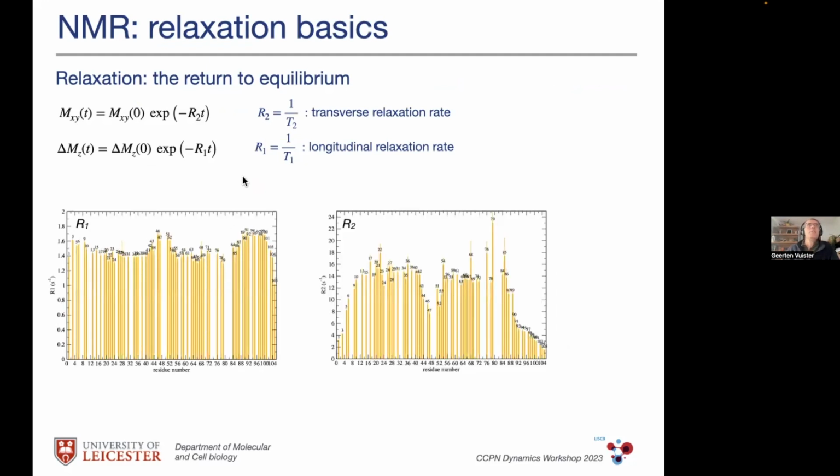Okay, as a result of doing that for each of our residues, we get essentially a bar plot. So what we typically get at the end are residues over here, so it's just residue number, and those rates plotted here for R1 and here for R2 on Hugo's favorite protein path. And that is because we can do this for every single peak of the 2D HSQC and just measure the rates for that particular point.